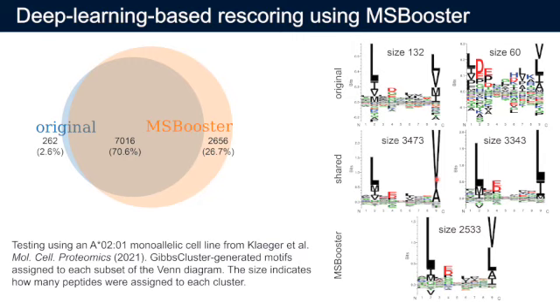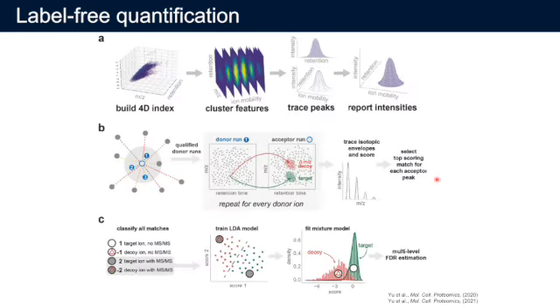After talking about the peptide identifications, let me move on to the quantifications. We developed a tool called IonQuant to perform the label-free and isotopic labeling quantifications. This diagram shows how IonQuant extracts the features and then performs the match between runs.